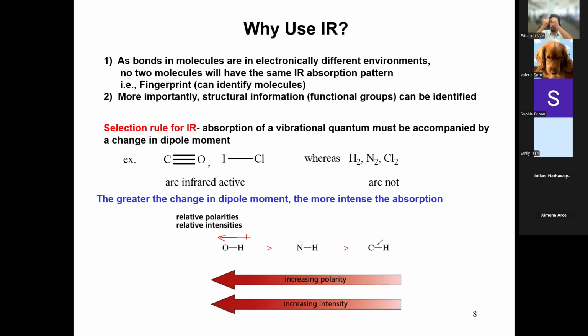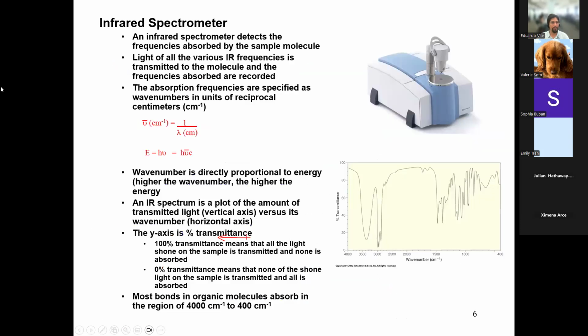And if we vibrate that OH bond, well, it's already a polar bond, and then when you're vibrating it, you're changing it, right? When you bring it far away, the polarity decreases because it's based on distance. And when you bring it closer together, you get an increased polarity. So your polarity is going large and small, large and small, large and small. So if you plug that into your y-axis, let me go back to the chart so you can see it. You're going to see that OH actually right here. You can see this whole peak. This actually is an OH vibration peak.